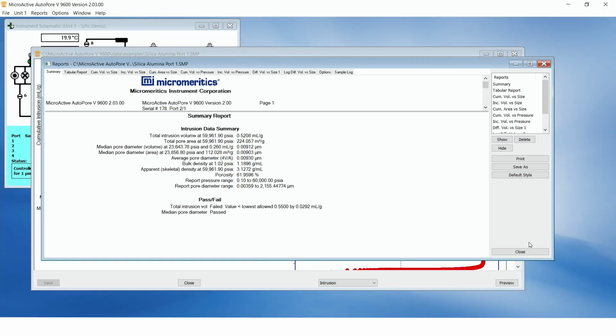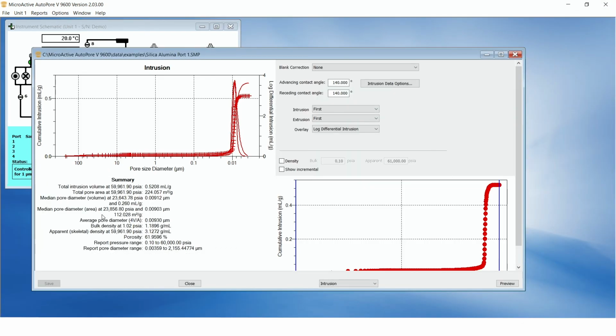And again, I've been asked many times what those mean, and I wanted to use that as our last and 10th tip. But again, by no means our least important one.